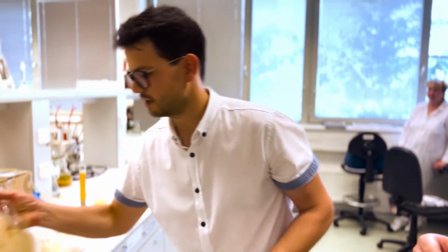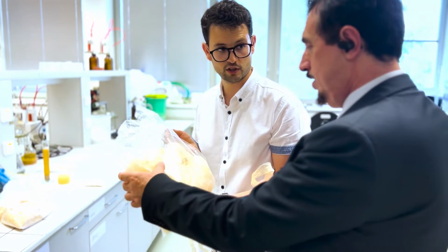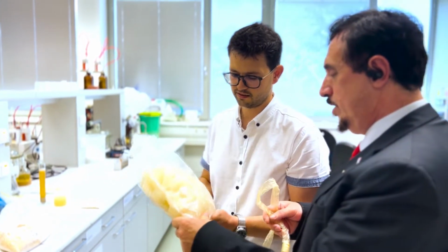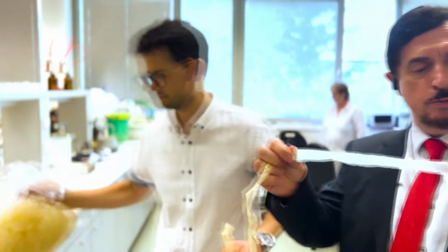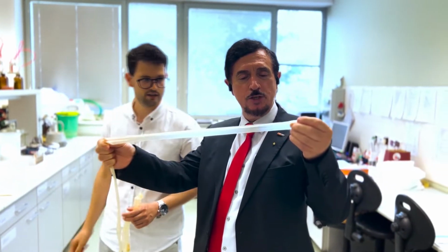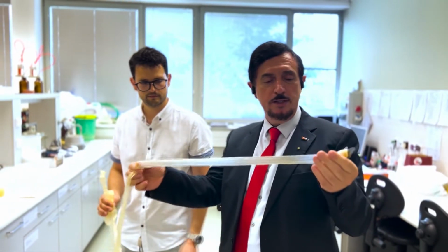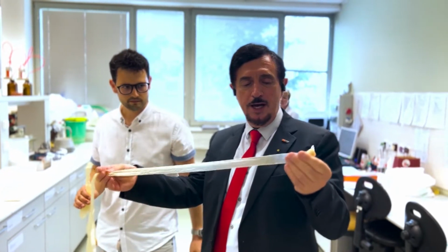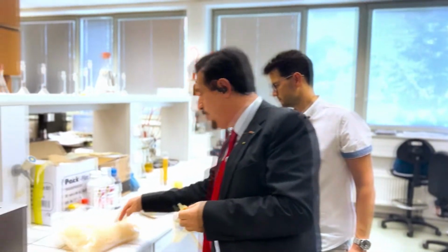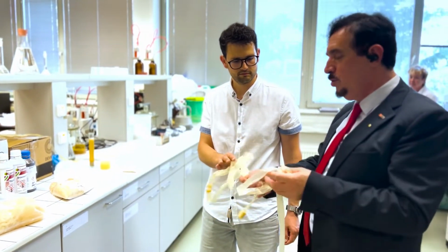Usually, it is a challenge to find a sustainable solution for this. So this is a waste from a different part of the process. Yes, of the sausage. So this is normally the covering of the sausage. Exactly. It is what we buy when we get an edible sausage in the store. So this is organic material, and these are waste, not off-grades or any other type of waste. Yes, exactly.